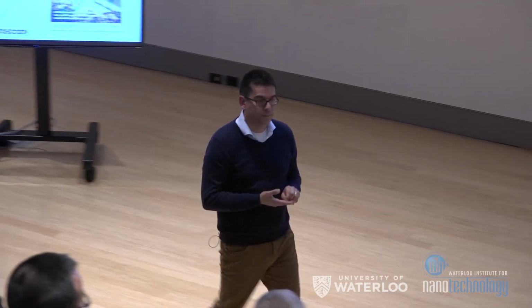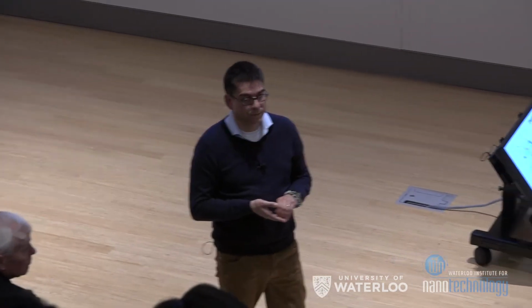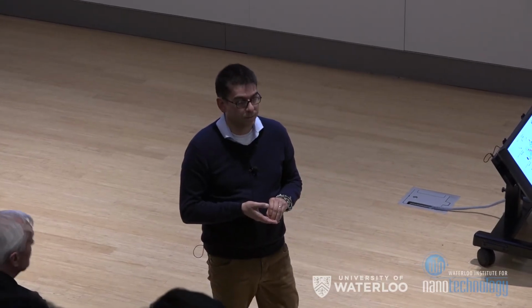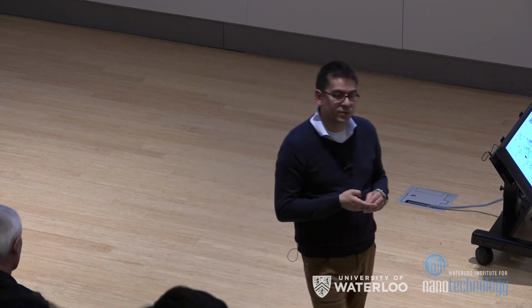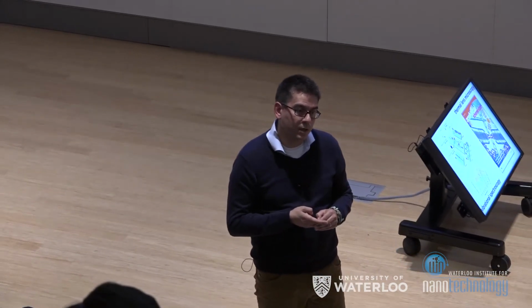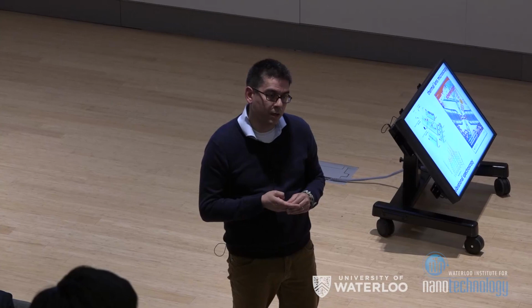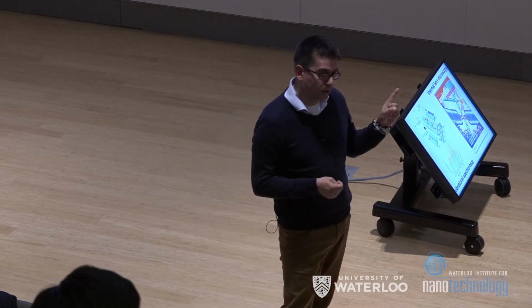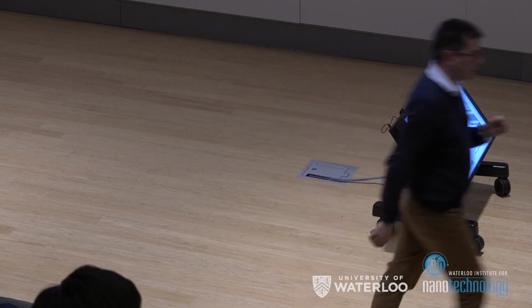Very impressive. I'm interested in the way you do the thermal work with the droplets, where you have the heater at the bottom and the droplet comes in, because the droplet is moving so fast. Would the heating be sufficient? When the droplet passes the heater and you heat it up to a certain temperature, is that what you do? Was this for the PCR? Yeah, the new PCR in the droplet phase.